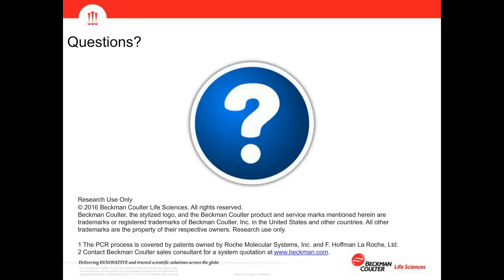So, 12 sample library prep. It really depends on the protocol. There are protocols that are day long, and for a day long protocol manually, our systems can handle anywhere typically from 1 to 96 samples, and the automation is capable of processing 96 samples in approximately the same amount of time as a smaller number of samples.